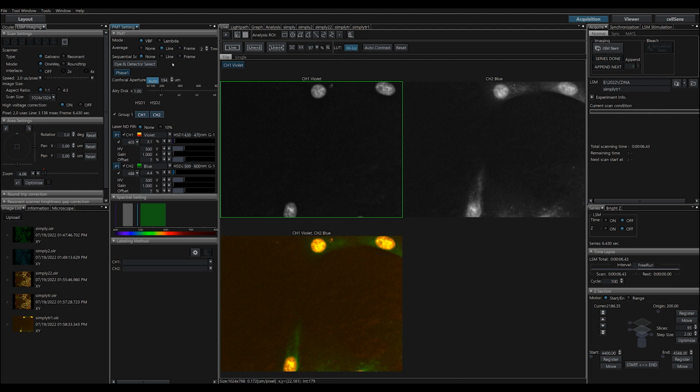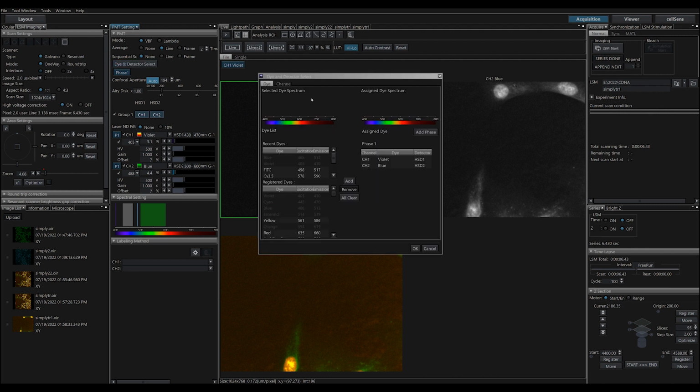So this is a sequence. This sequence has to be given when we have more than one dye and their excitation wavelengths are very nearby. This is the dye and detector settings. Here we need to select the dyes. This indicates the excitation wavelengths. This is the emission wavelengths.